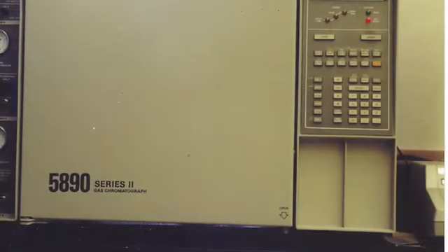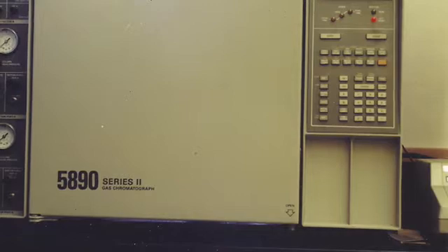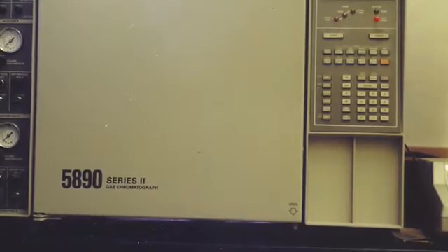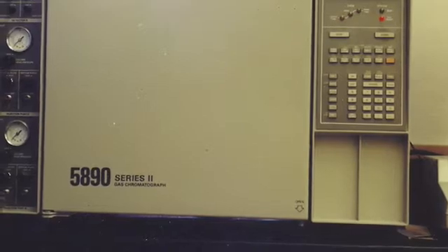So here's a picture of the front of one of our gas chromatographs. You can see it's got lots of buttons and dials, and the modern ones are computer operated, and this was an old timer, but it was a very good one. So that's what they look like from the outside.